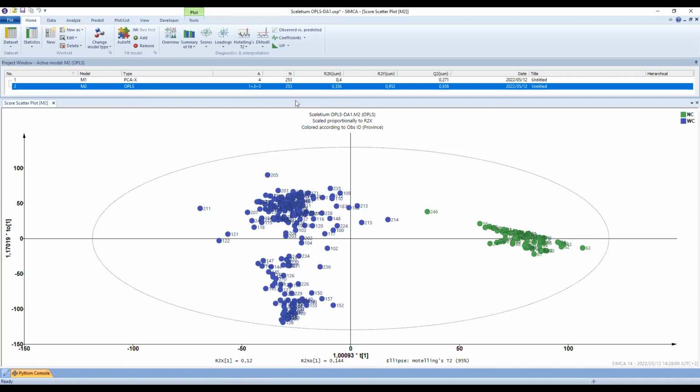We only modeled a small portion of our LCMS chromatographic data. The rest is not modeled. So it would be nicer if you can model more than 50%. Otherwise, the model is saying that a lot of your data is not really relevant. And then your Q squared here is very high. It's a 0.936, which means that the predictive ability of this model is actually very good.